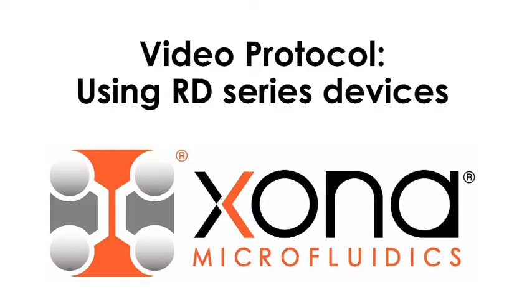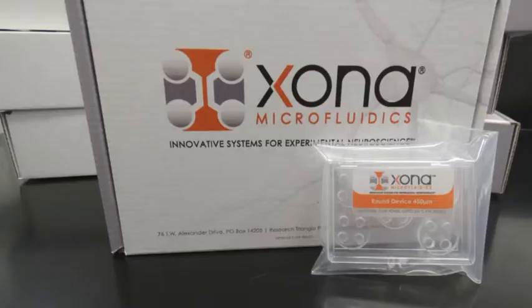Today in this video protocol, we are highlighting our RD series of devices. The RD stands for round devices. These are devices made in silicone or PDMS and are a miniaturized version of our standard silicone devices.